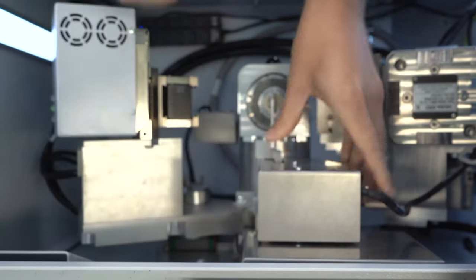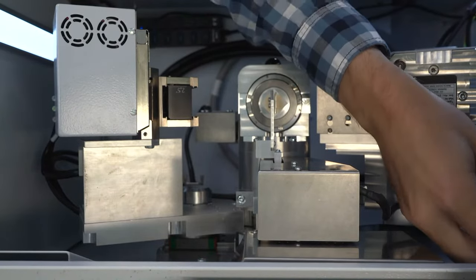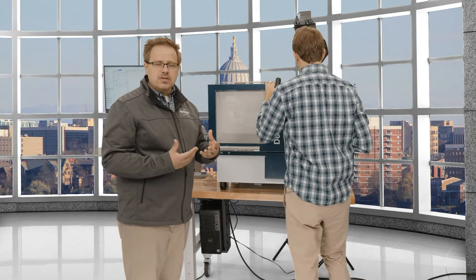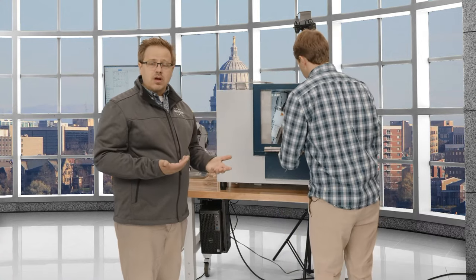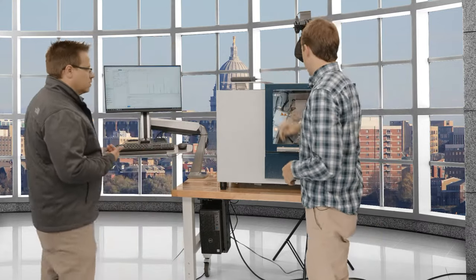And another neat thing is that because this is using a form of that Da Vinci design for the system, he can plug it in, because right now the system configuration doesn't have it in there. So it's not powered. That's right. When it's not mounted, it's powered off.